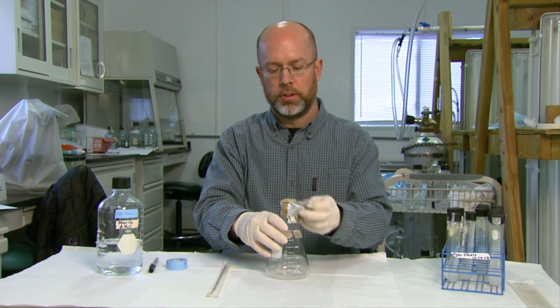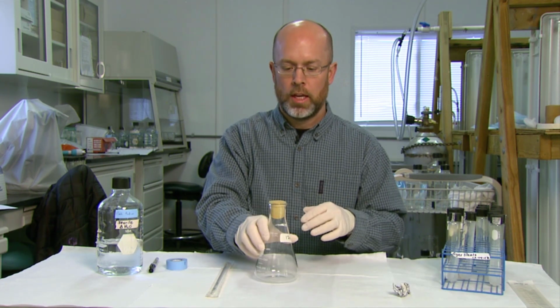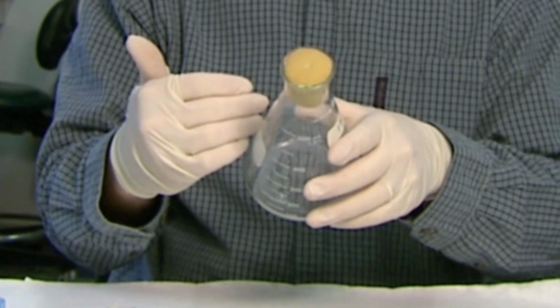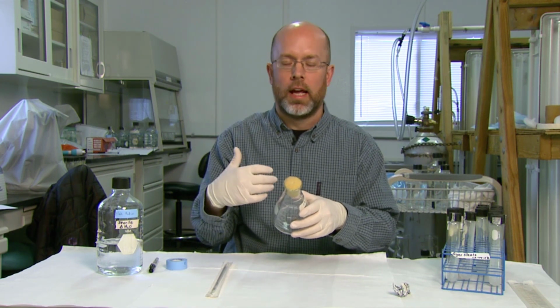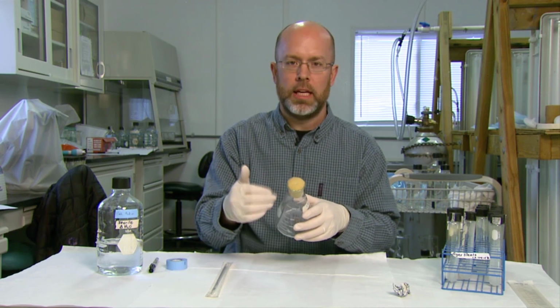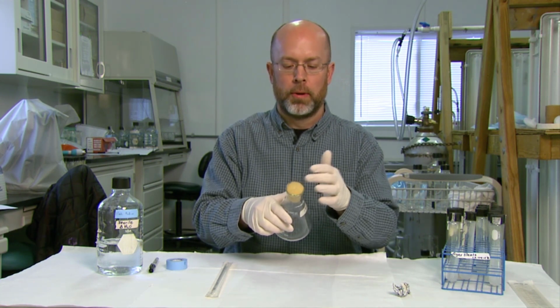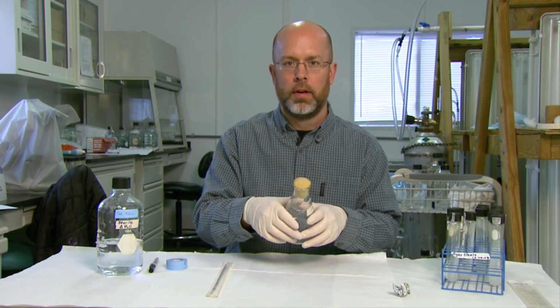So first thing you need to do is take obviously the aluminum foil off. And you can see in the top there is a foam stopper. This stopper prevents air from getting into the culture and contaminating the culture. Any air anywhere has algal cells, bacteria, fungal cells floating around in the air. And you have to keep that from getting into your culture if you want to maintain monocultures. So you put this foam stopper in first before the autoclaving process so that the flask and the stopper are sterile.